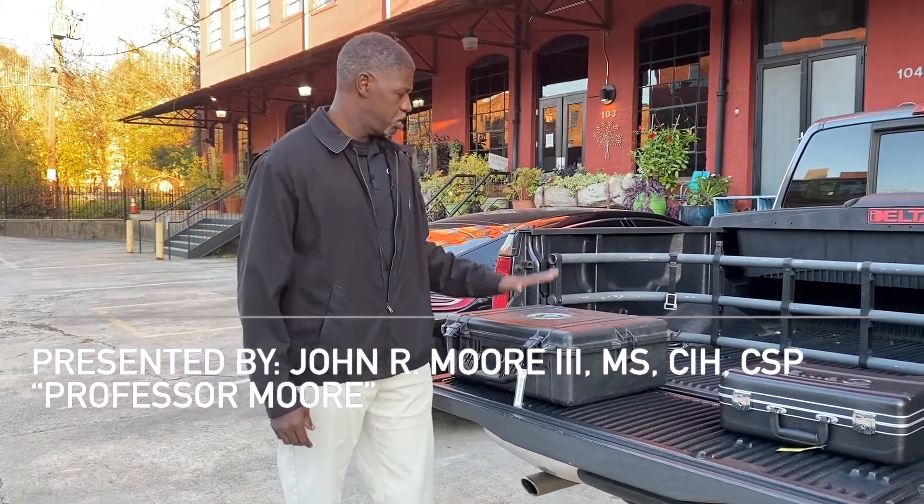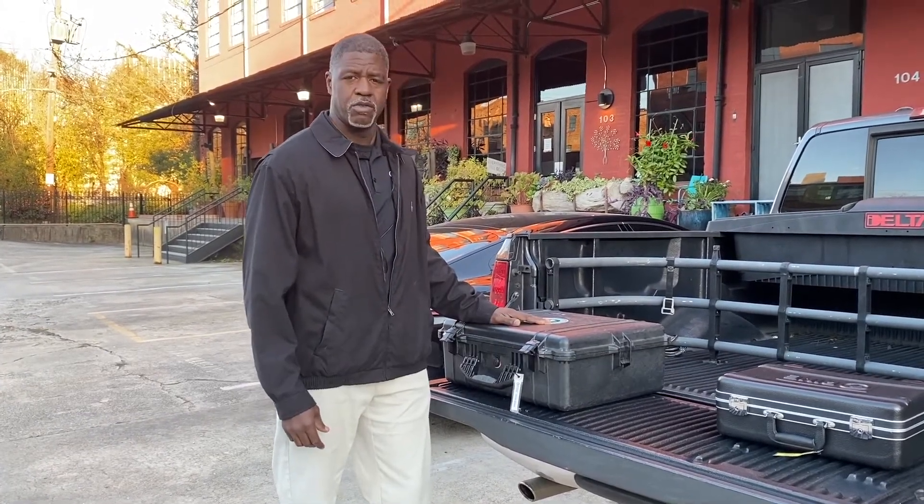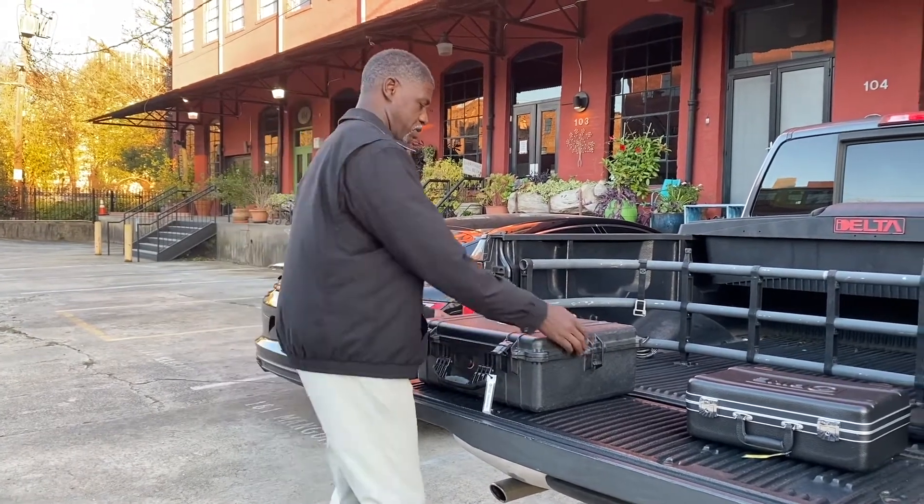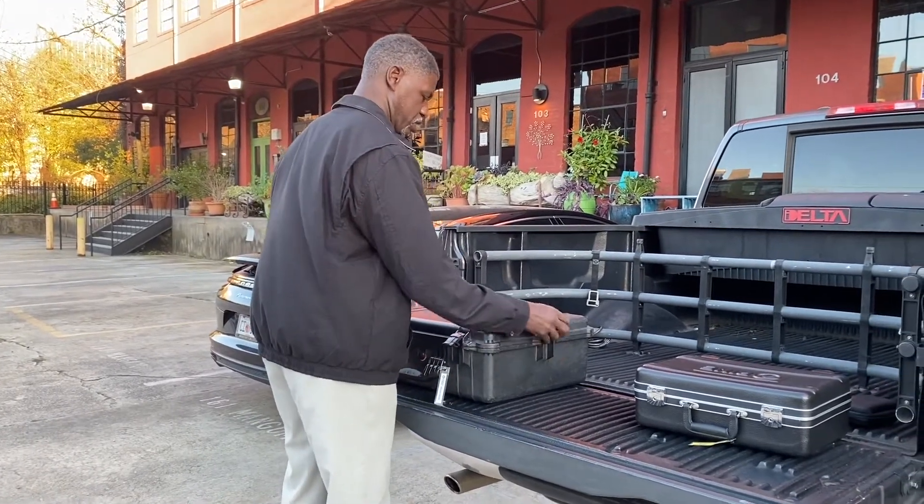Greetings class. Out here at the tailgate, I'm going to go over a few air sampling principles. The practice of air sampling has always been one of my favorite things about industrial hygiene.